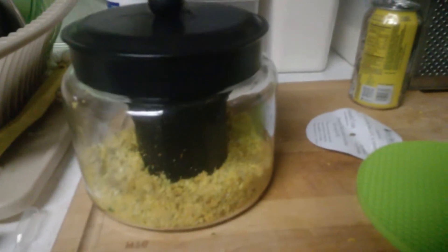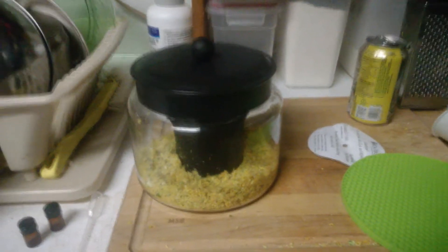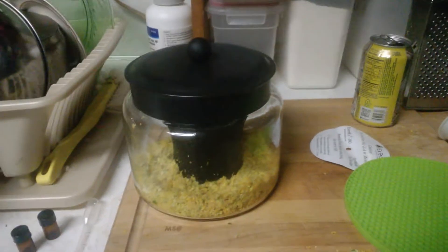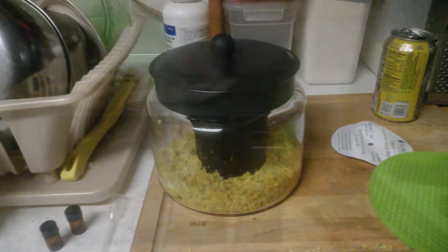I have the citrus zest put inside the SNX 100. We're about to throw it in the microwave for about 6 minutes to see what kind of citrus oil we gain out of this distillation.